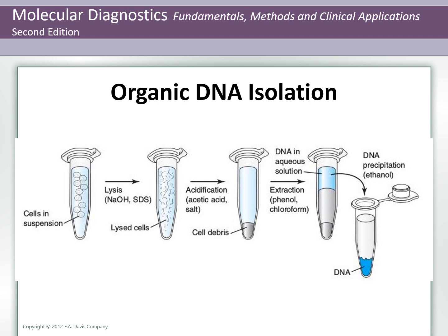The last step, precipitation, is when DNA in the upper aqueous phase is precipitated by mixing with ethanol or isopropanol and salt. The DNA precipitate is collected by centrifugation. Excess salt is removed by rinsing the pelleted nucleic acid, centrifuging, and then discarding the supernatant and reserving the pellet.